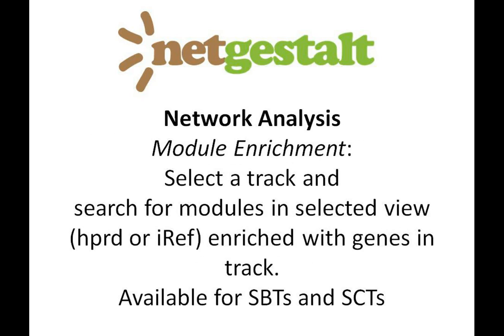The tool is available for single binary tracks and single continuous tracks. Select a track and the module enrichment tool will search all of the gene modules that are statistically enriched with the track's genes. For single binary tracks, a Fisher's exact test is used to evaluate whether the genes in the track are enriched in any of the network modules.